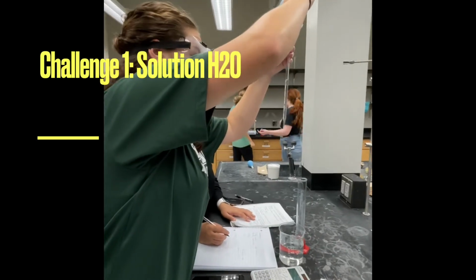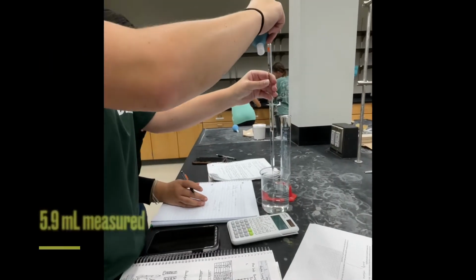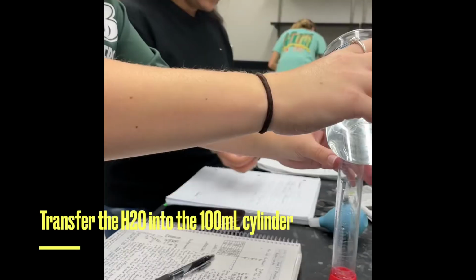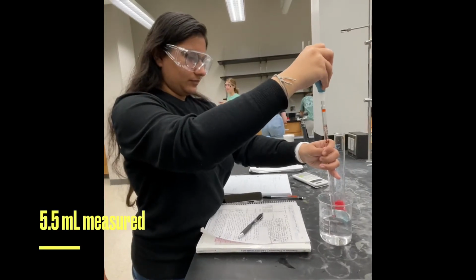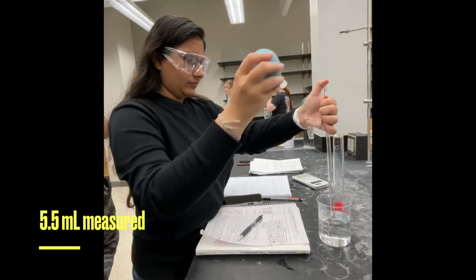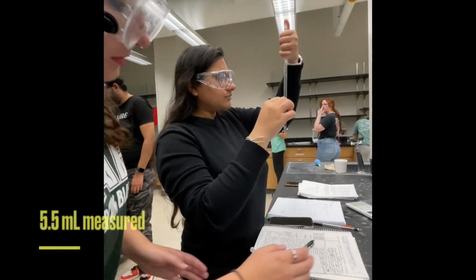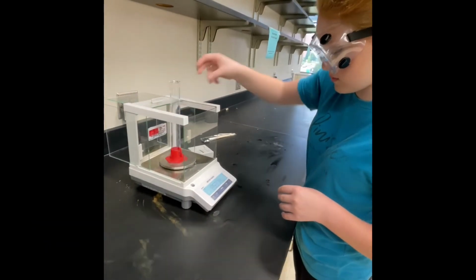Now that we know about the experiment and the meniscus, we will turn to the experiment itself. In the first challenge of the experiment, we were determining the density of water with the pipette and then transferring the solution into the 100 milliliter cylinder. We logged our data for the water we collected into the pipette and weighed it. We did this 3 times each and compared our results. Here the reading is 5.5 milliliters. Here the reading is 108.389 grams.